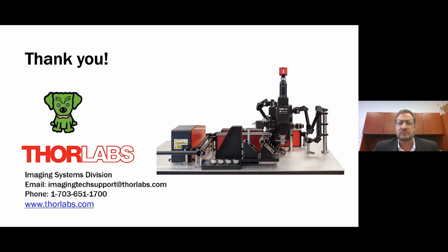Yeah, I'm moderating this, but I've also worked on this product. For doing the curve fitting to get the lifetime, the maximum we can do before pileup means we can't curve fit is about 30 million photons per second. But because we're doing it digitally, we can count more than 1 photon for the intensity image per laser cycle. So if you have a bright section, you might not get quite as many lifetime measurements, but you can still see the intensity there.